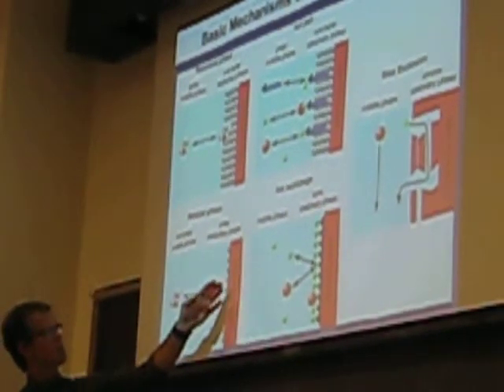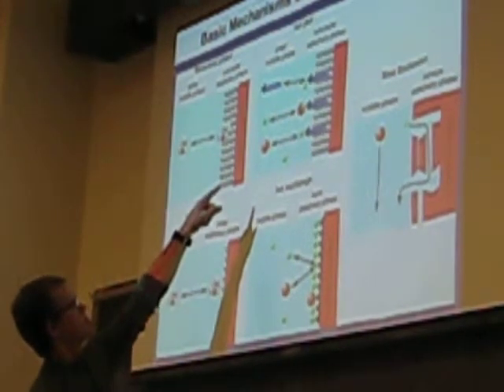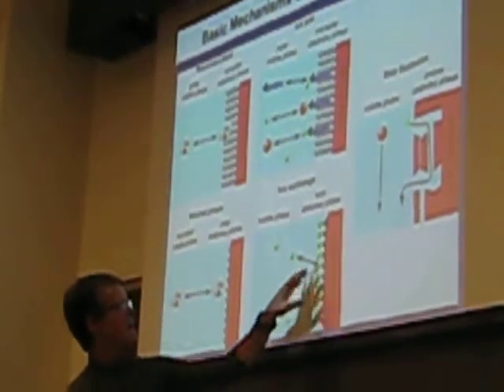So here it's polar stationary phase, relatively non-polar mobile phase, and then the opposite for reverse phase. Now, I'll talk about that in a second. Ion exchange, we're very familiar with this, right? We know this is, of course, is this an anion exchange column or a cation exchange column? What do you think it is? Anion exchange? Cation?